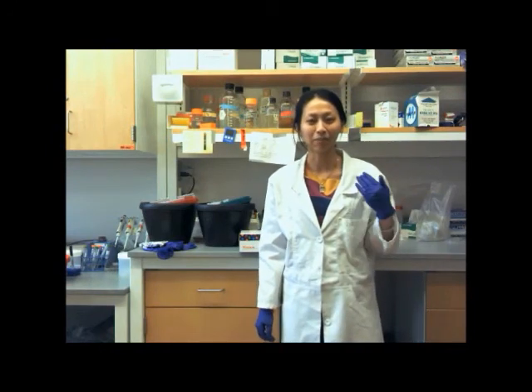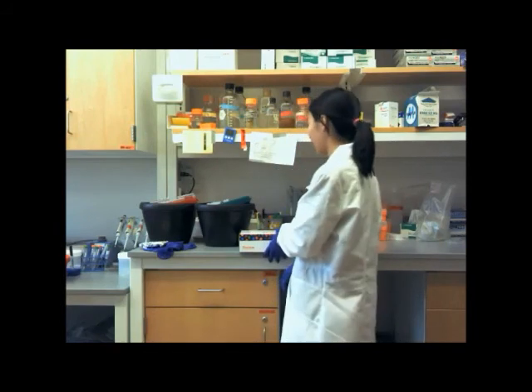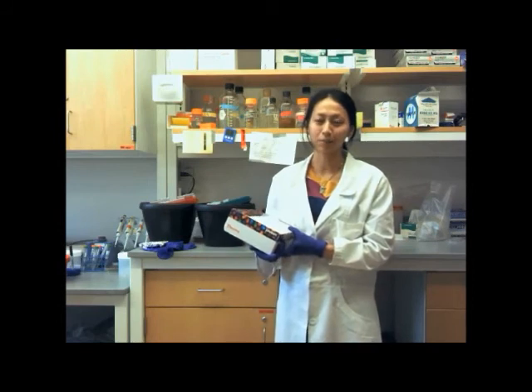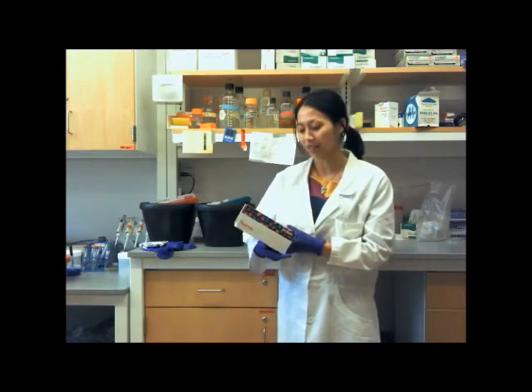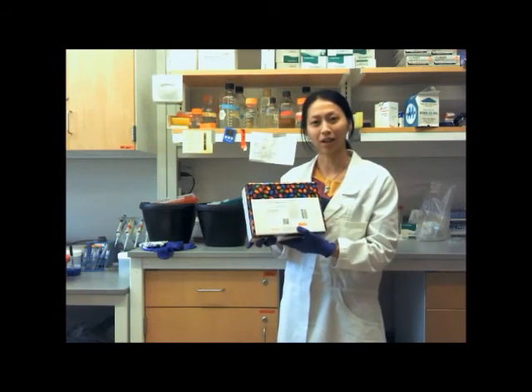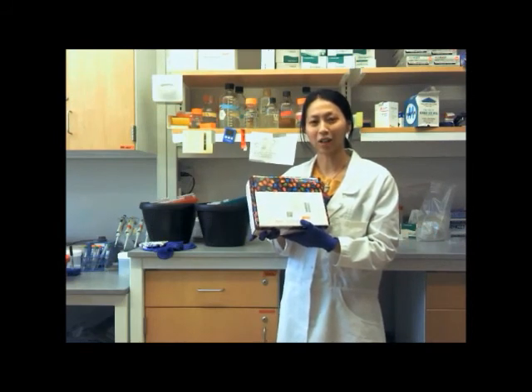At this station, me and my partner Xing Xing, which you will see later, are going to talk about using a method to determine the amount of protein in each sample. And the method we're using is a BCA method. It's a protein assay kit where we can run a standard curve to measure amounts of our known protein sample, and then using that to calibrate how much protein we have in our unknown samples.